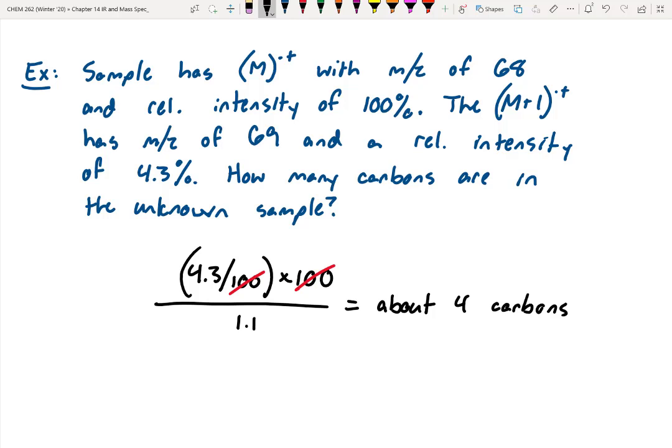What I always tell students with spectroscopy is it's like going to court. When you go to court, your job is to prove something beyond a reasonable doubt, right? Does that mean absolutely prove something using a mathematical proof? No, it means just provide a lot of evidence to support your case. So as a scientist, we would just want to have overwhelming evidence. Does it mean that all the evidence will be in perfect alignment? Not always. Sometimes you've got kind of gray area evidence where it's hard to tell. But for right now, we're just going to approximate as best we can.